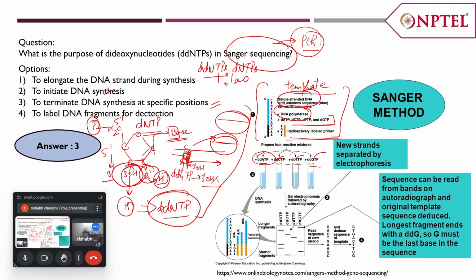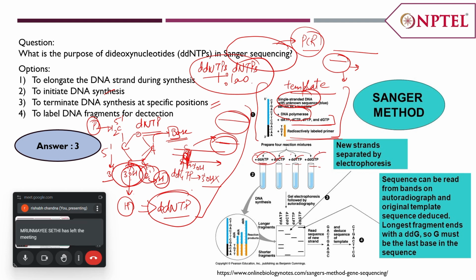Okay, why is this so? Because if we are having a chain termination, that means we will have fewer chain terminations. So that will help us to yield a band on an agarose gel. So that is why we have used this kind of ratio for the particular experiment. Now, after incubating this with the dideoxy method, we run it on an agarose gel in different wells.